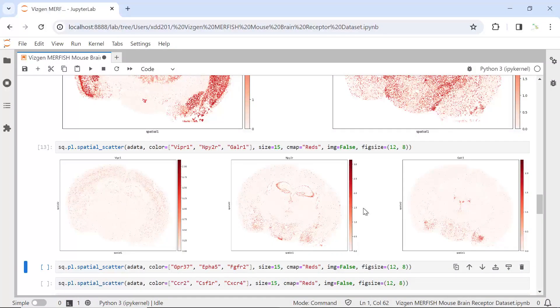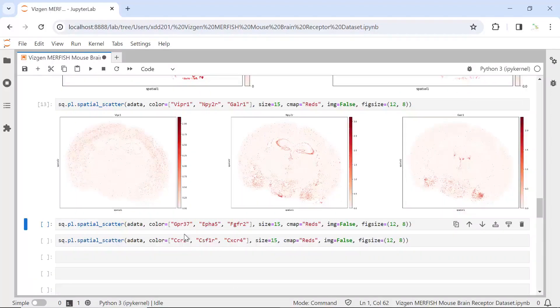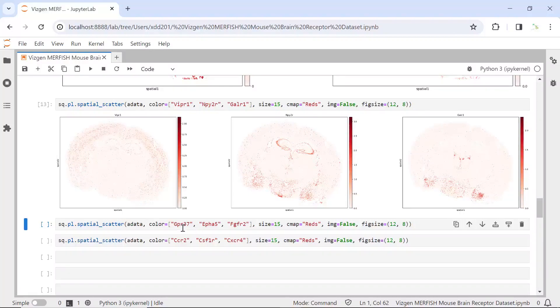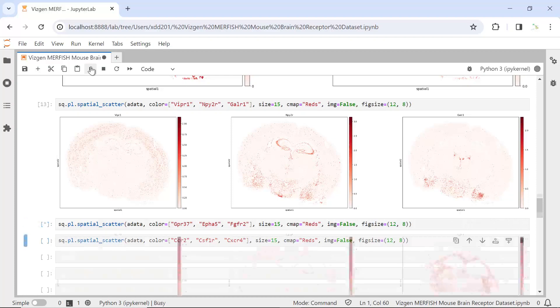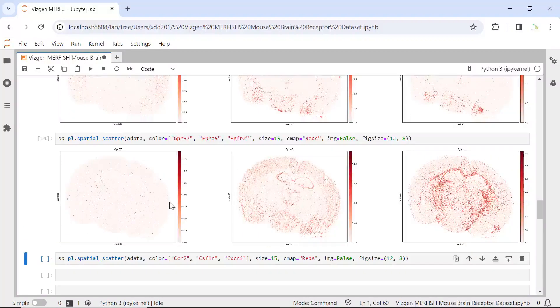We can also plot other receptors. For example, we can plot GPR37, which is a very important receptor for oligodendrocyte myelination. Then EPHA is the receptor for classic axon guidance molecules. We can also plot a growth factor receptor — here we are going to use FGFR2 as an example. So let's make the plot to see the expression of GPR receptors, axon guidance molecule receptors, and growth factor receptors. You can see from the plot the expression in different regions of the mouse brain.